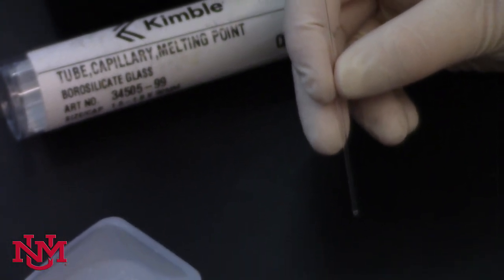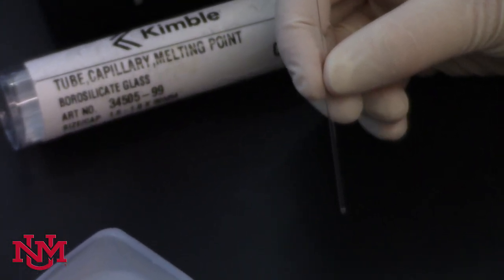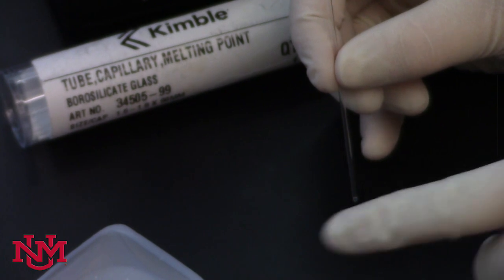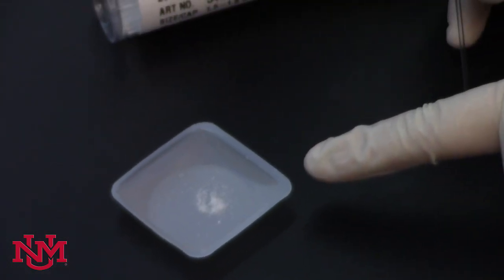The first thing to do to start taking the melting point is make sure you have the tube in your sample. You don't need a whole lot of your sample. It should be a nice dry solid.